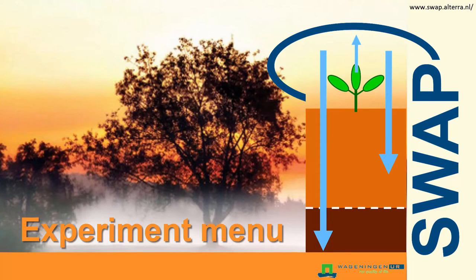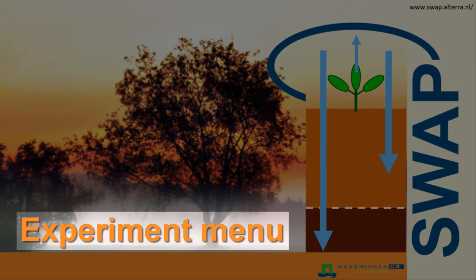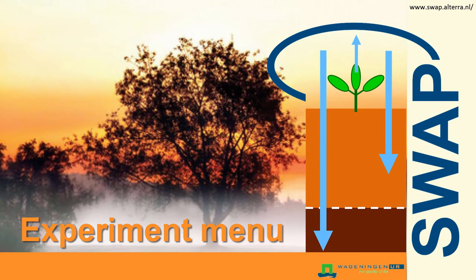In this clip, I will explain how the experiment menu of the SWAP interface works so that you can open and save your first experiment.